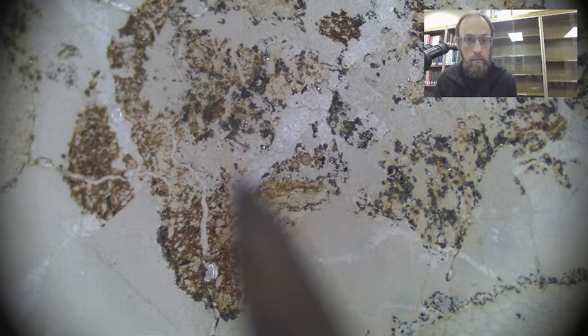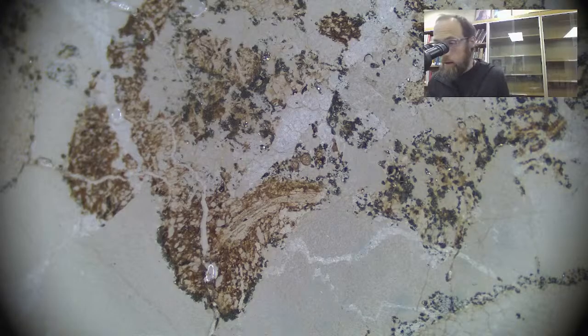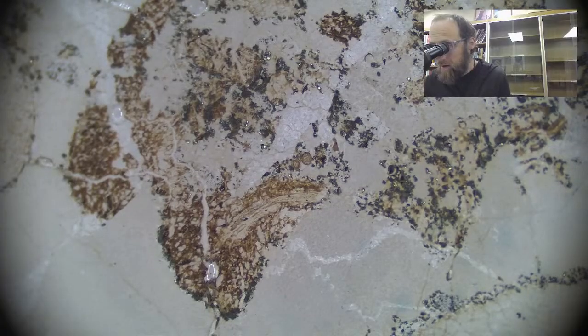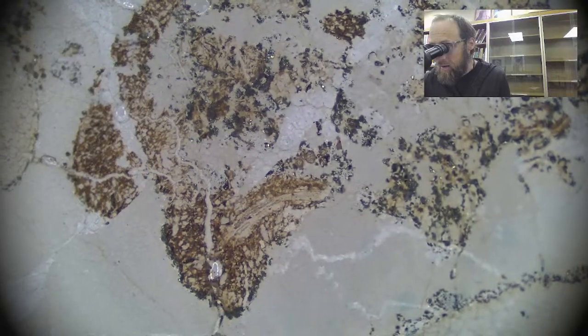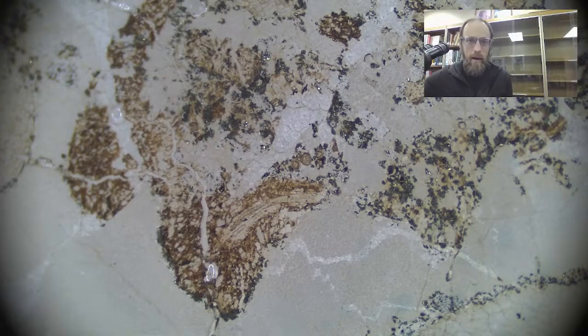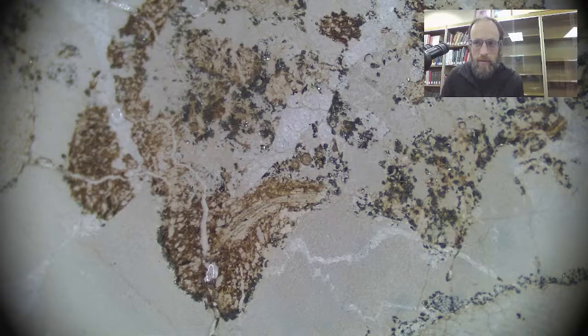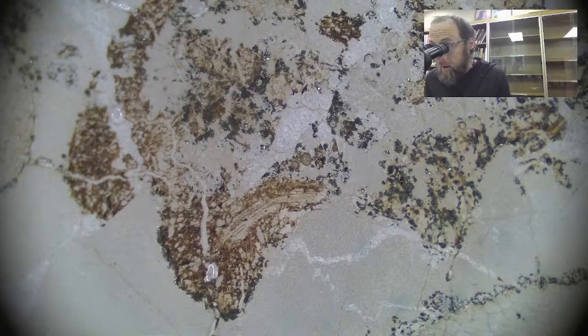right there-ish. You can see that round figure, and it almost looks like those diagrams in animal development texts where we have a blastocele or something like that, a primordial sphere of developing tissue.